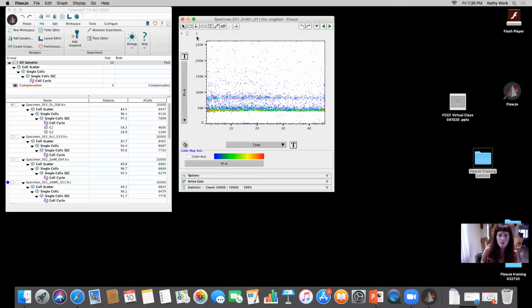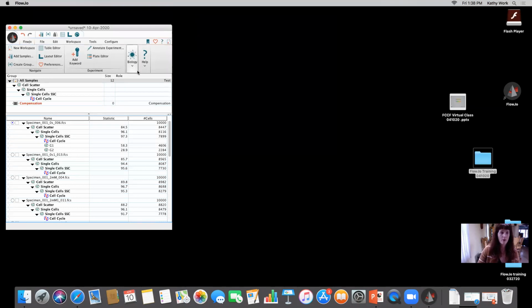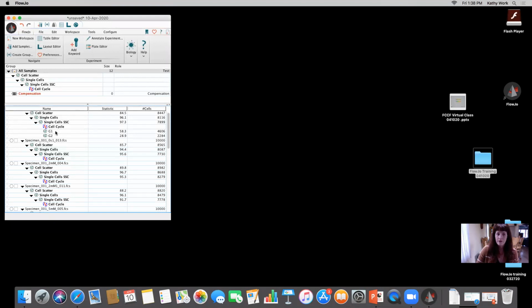Okay. Any more questions, or we're good on that front? Okay. We're good. Perfect. Okay, so I'm going to close out that, and those are great questions. Keep them coming, guys.